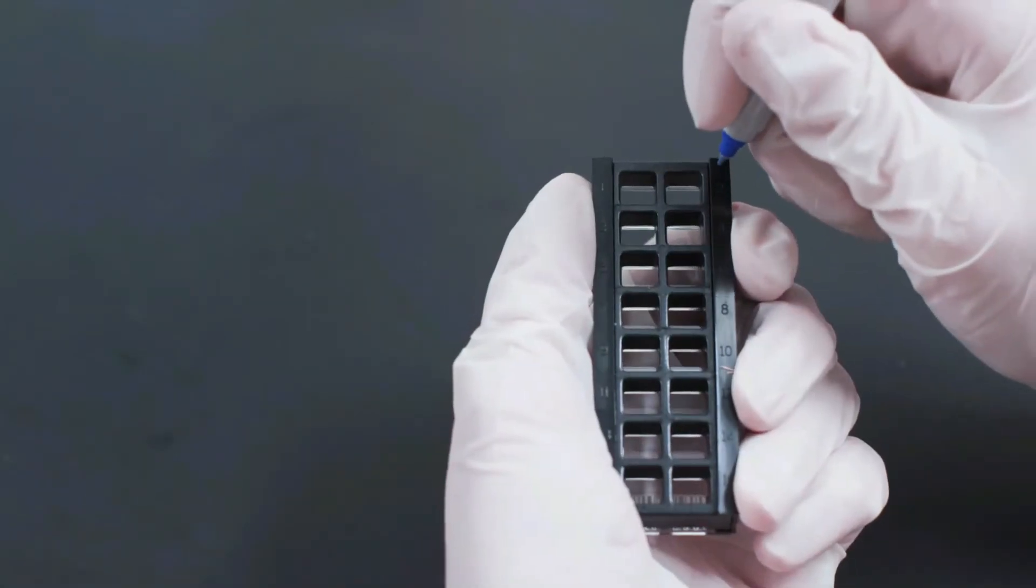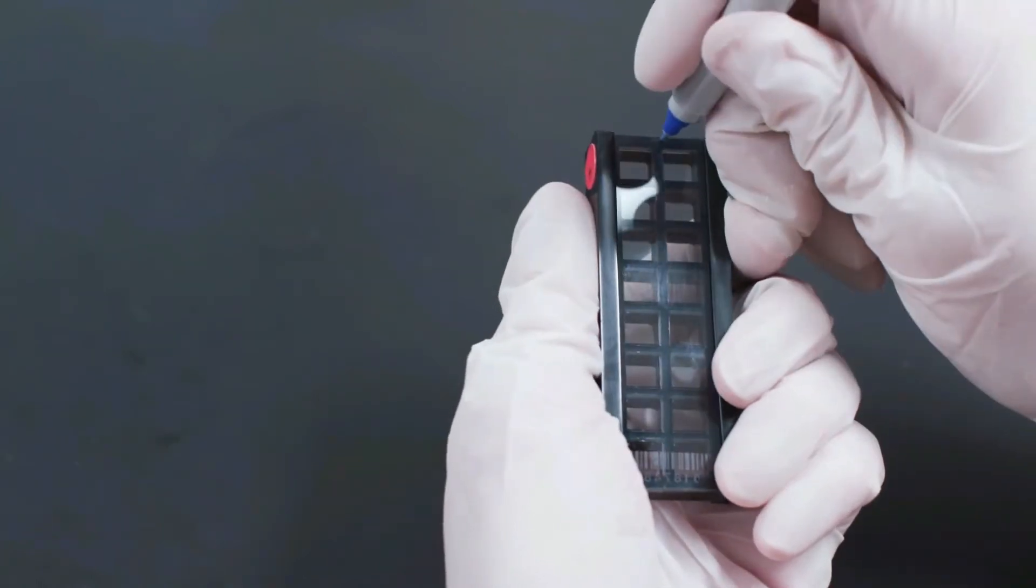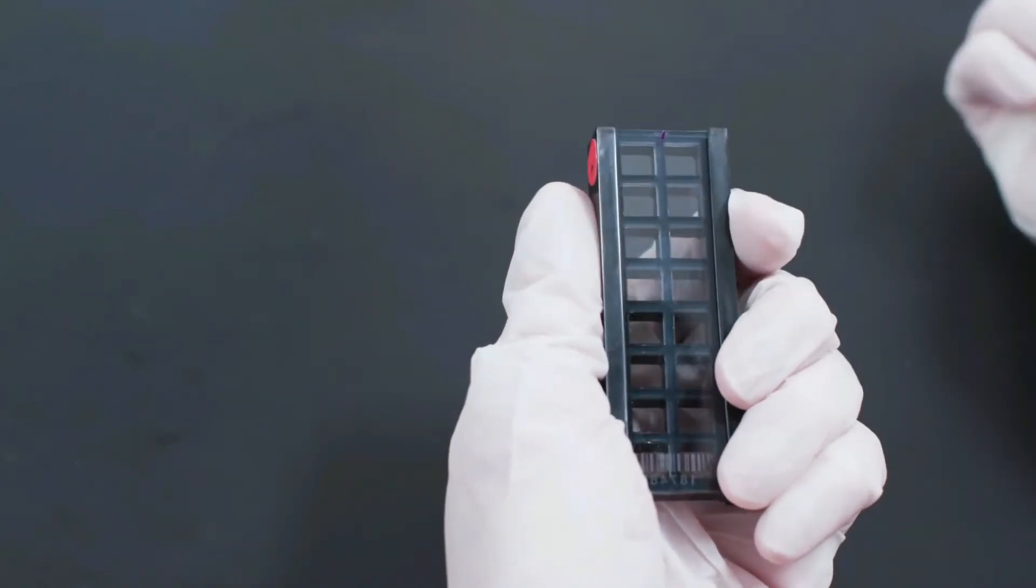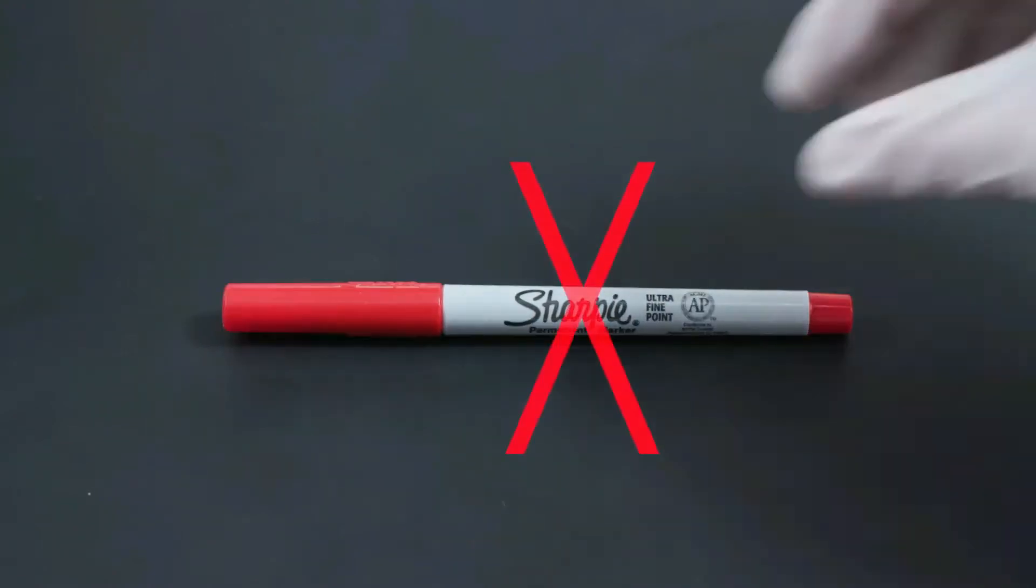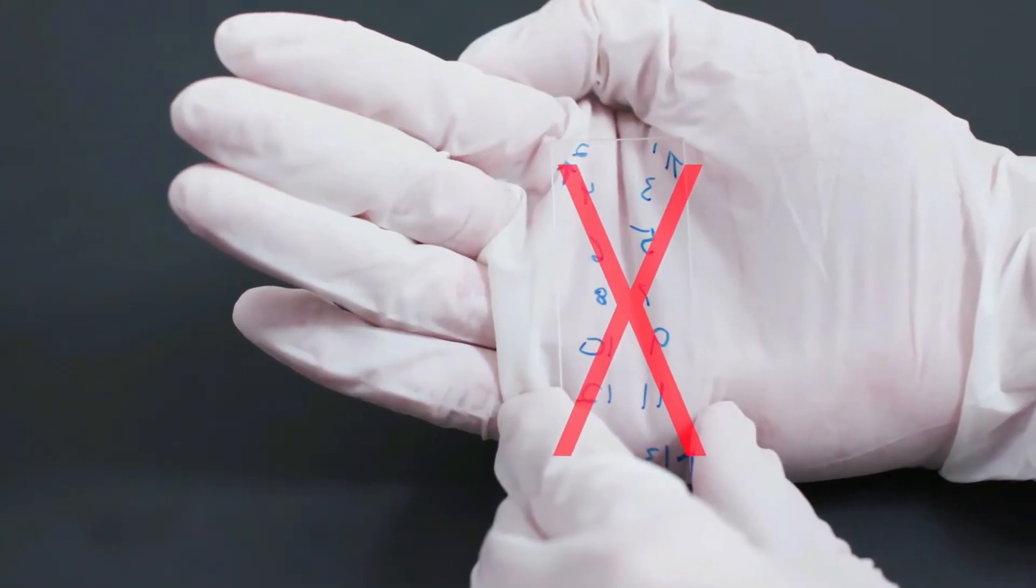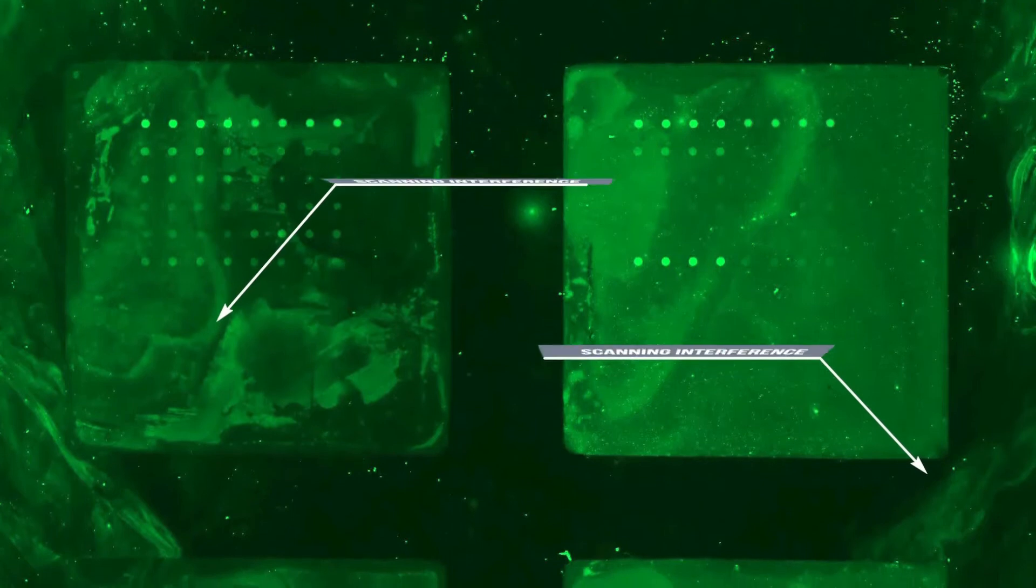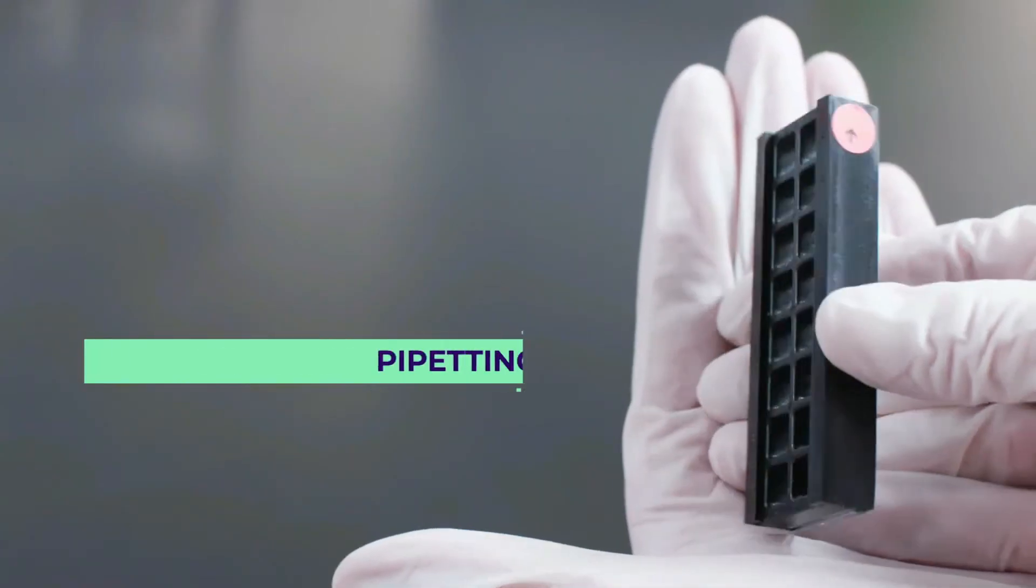If you're using more than one slide, you should mark the slides to differentiate them. It's best to make a very small marking along the top or bottom edge using a fine point permanent marker. In our experience, red or black ink can interfere with the array signals, so only use blue or green ink on the slide. Never write on the actual well area, as this will interfere with scanning.